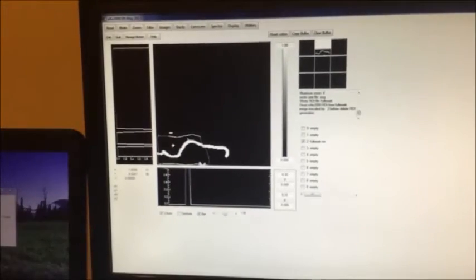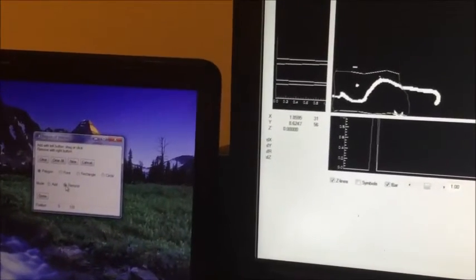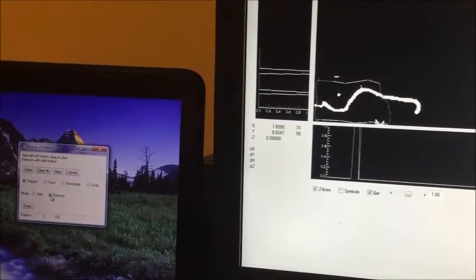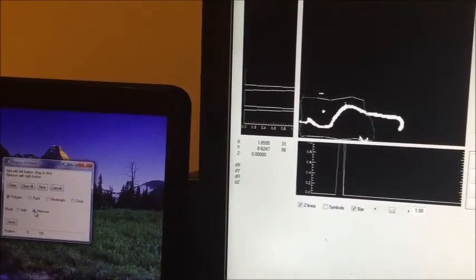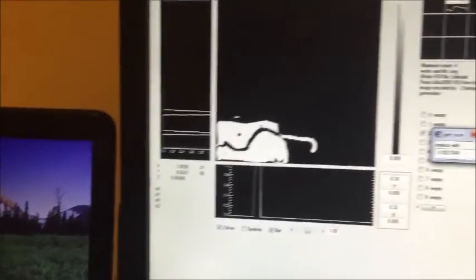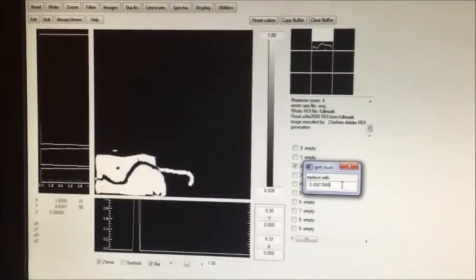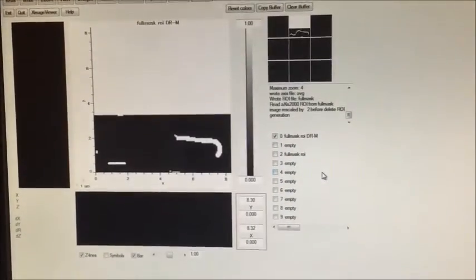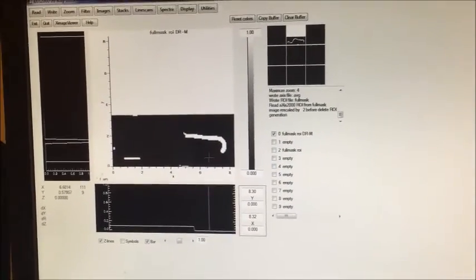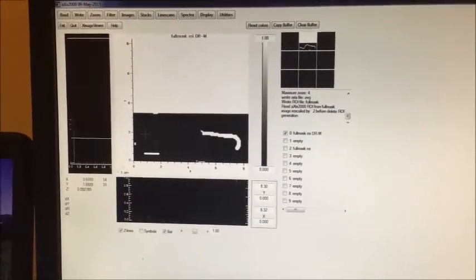Okay, after that, you can see here the remove. Click on that. You are going to remove that particular region of the nanowire from that mask. So click done. Okay, this small window will pop up. Just press enter on your keyboard, it will go away. So you can see here all the regions were wiped off.